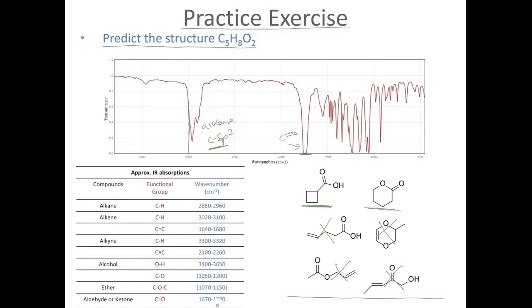What you need to know for carboxylic acids is that they have a unique signal in the IR spectrum. The signal usually begins from around 3,300 and goes all the way to around 2,500. It is not a smooth peak, but anytime you see a peak like that, that's a signature for a carboxylic acid, which means that the compound represented here is likely to be an ester and not a carboxylic acid.